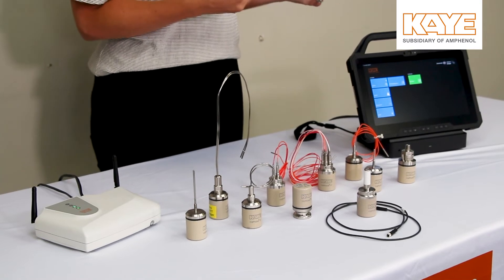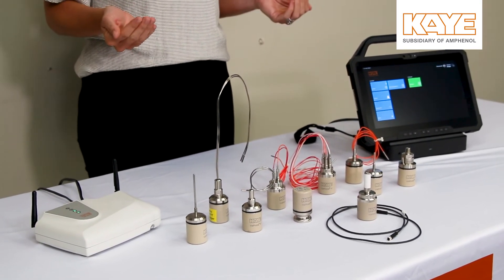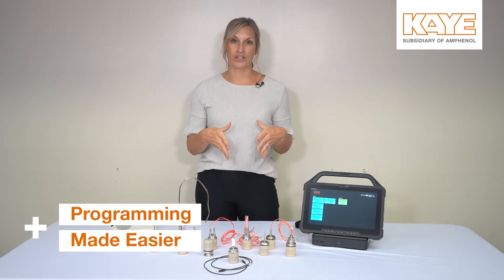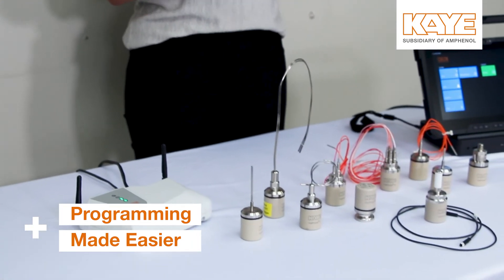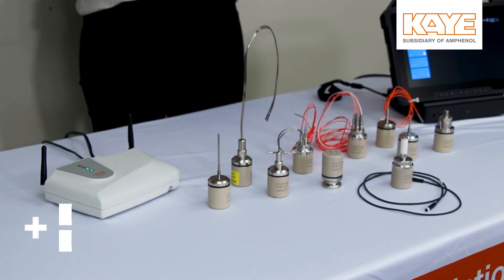You can either continue to watch your real-time study or you can stop the study and start your reporting. The RF-off feature is very attractive to our standard Valprobe users. If you like programming all your loggers and running multiple studies, you can now do that with the Valprobe RT system with 1.2. You still eliminate the reader, so it takes you less time to program and get your data after the study has been complete.